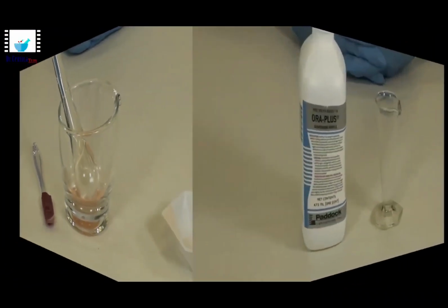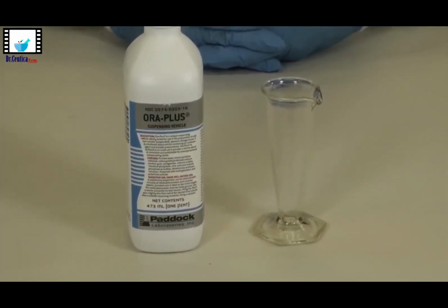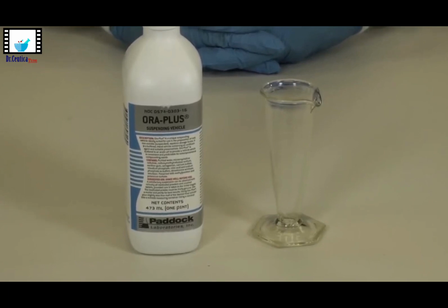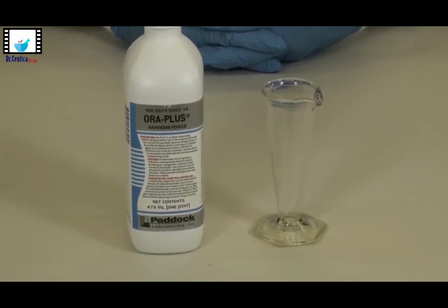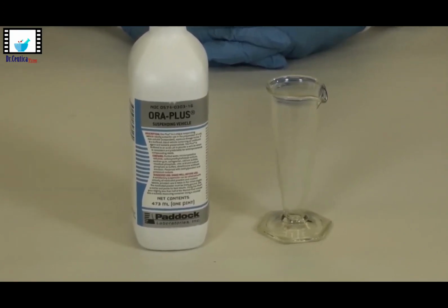After getting uniformly mixed powder, we move to the next step, adding the liquid components. Here is a bit different from what we've said in the earlier steps. Usually we said we pre-measure the liquids before starting the procedure, but here we are going to measure the liquid while we're working.